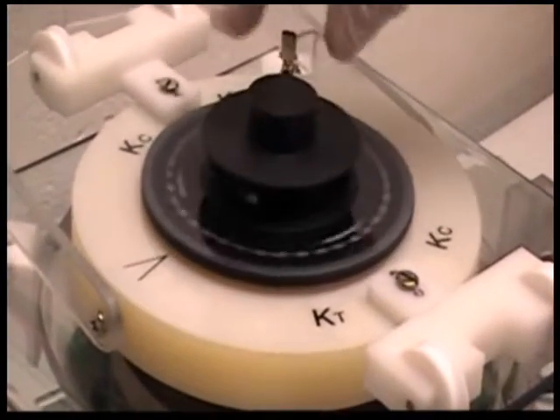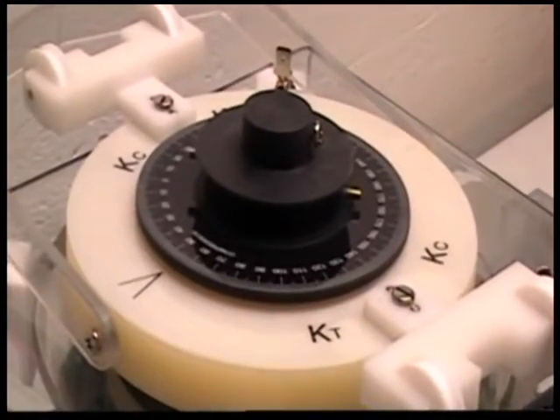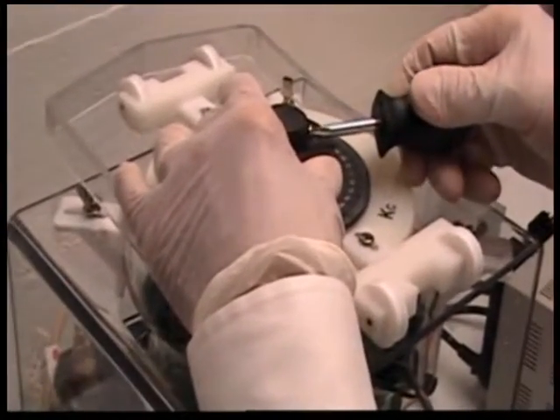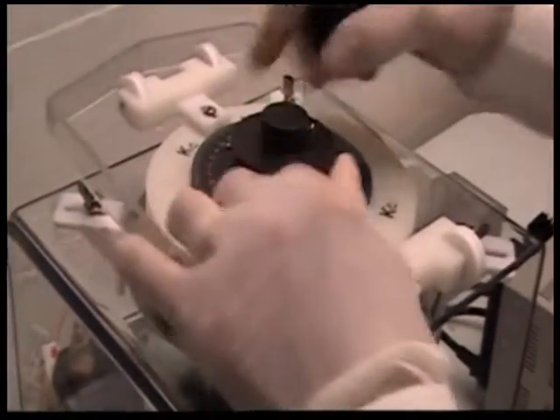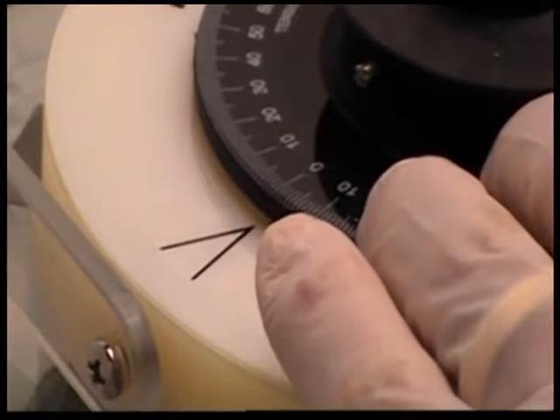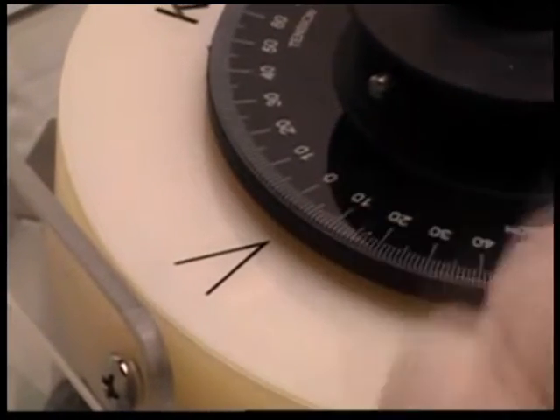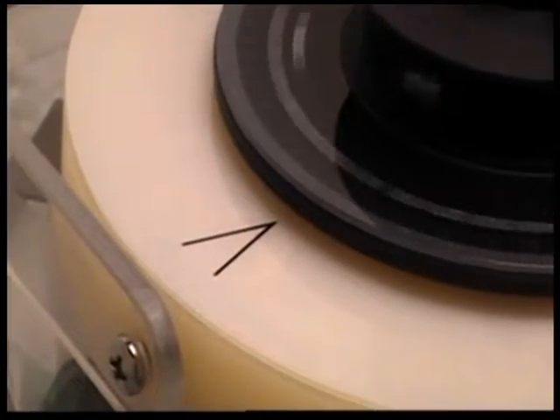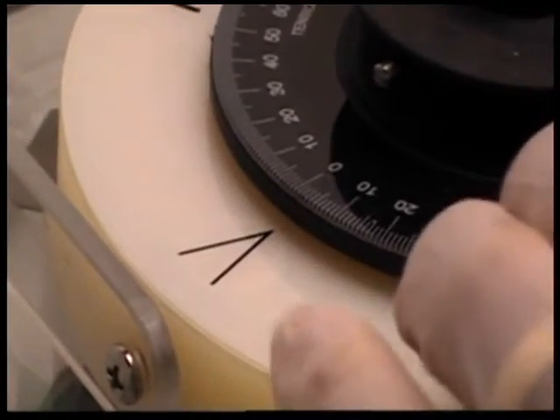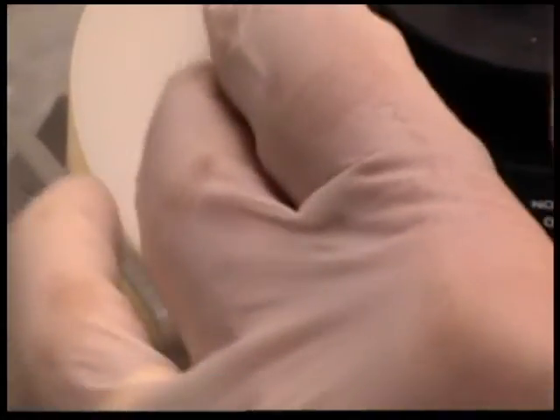Notice that the dial reflects the movement of the spiral underneath. We need to begin by zeroing that dial with the arrow. There's a screw here that we loosen. Now you can see that the spiral is not recording the movement. We'll move the zero to the arrow, then simply tighten the screw. Now you can see that movement again is reflected.